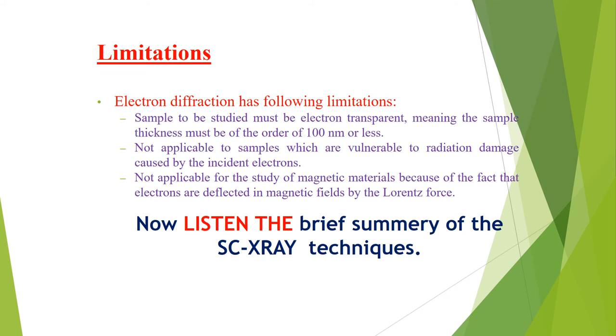In the theoretical background of the single crystal X-ray technique, there are some points to remember. A crystal with more electrons will scatter X-rays more strongly, and the effectiveness of the scattering of X-rays is called the scattering factor, or form factor, which has the symbol F naught. The scattering factor depends on the number of electrons around the atom, the Bragg angle and the wavelength of the X-rays. The scattering power decreases as the Bragg angle increases.